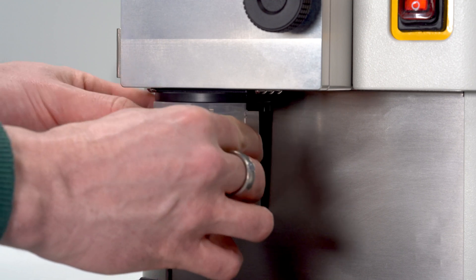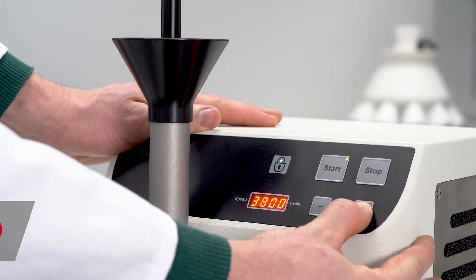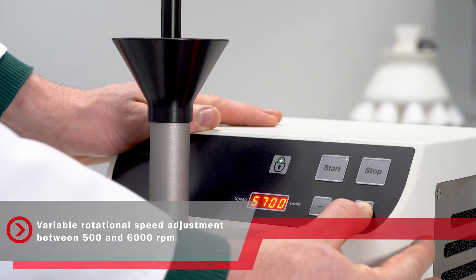Put the sample cup into the mount, turn the instrument on, set your rotational speed, and the P29 is ready to mill.